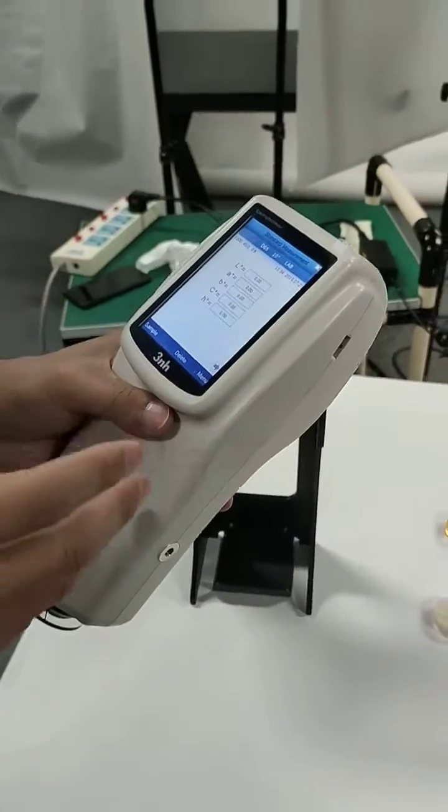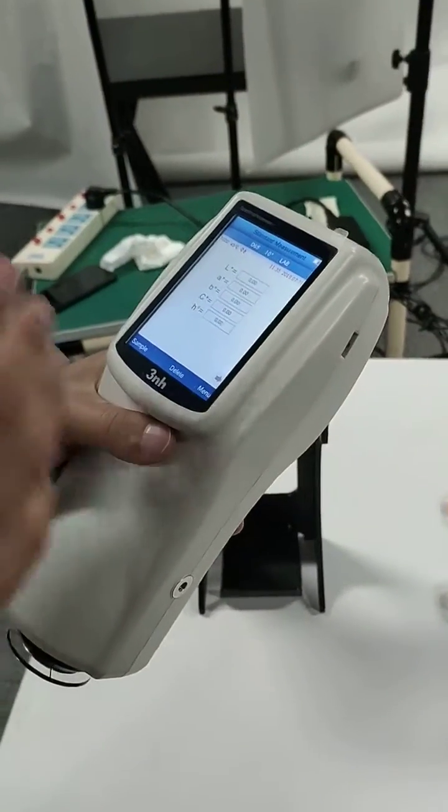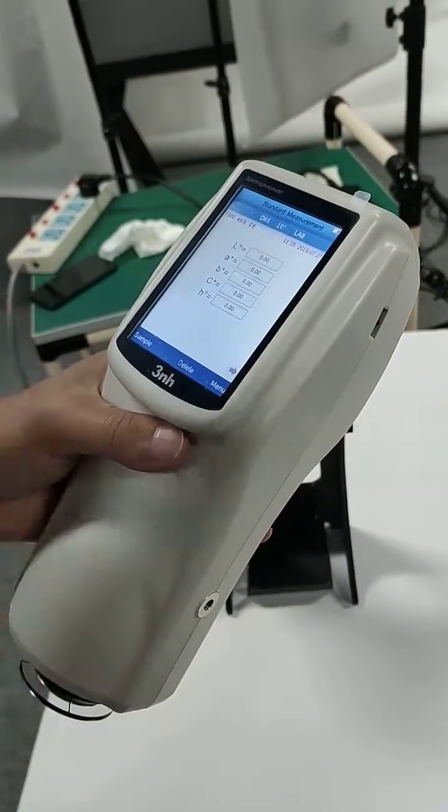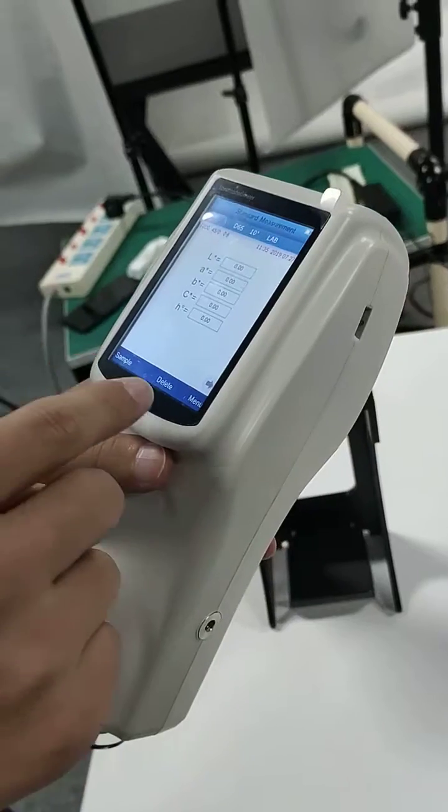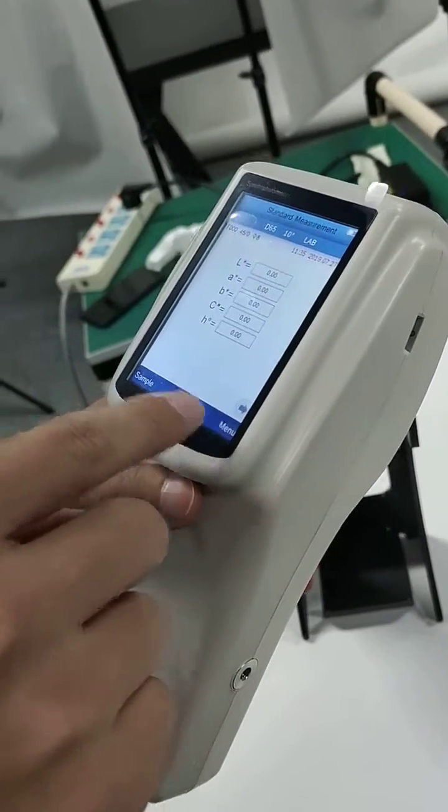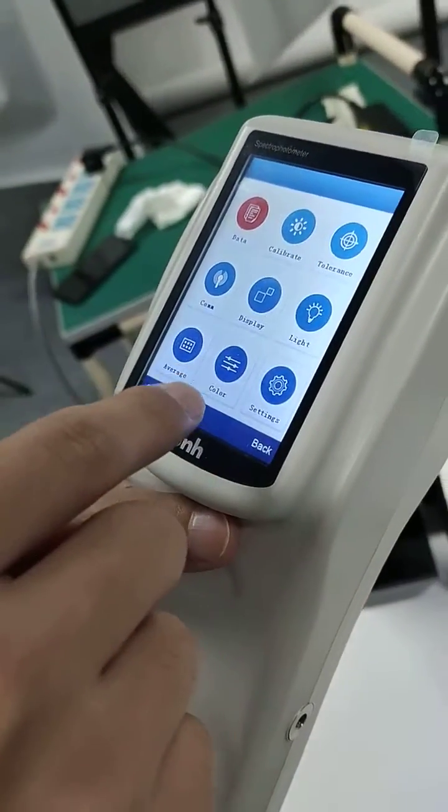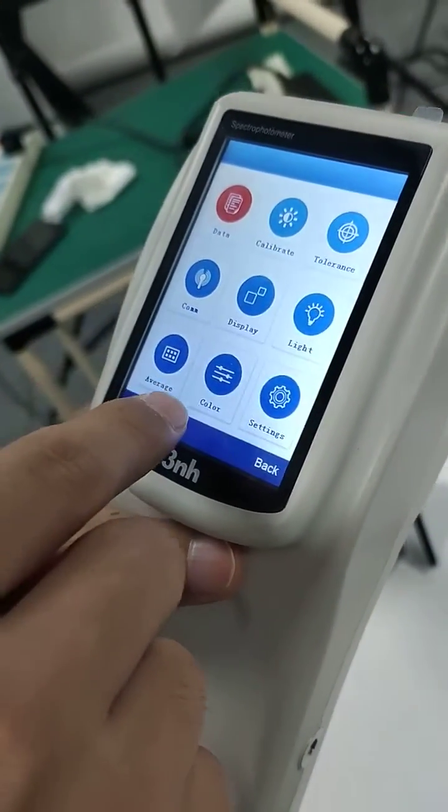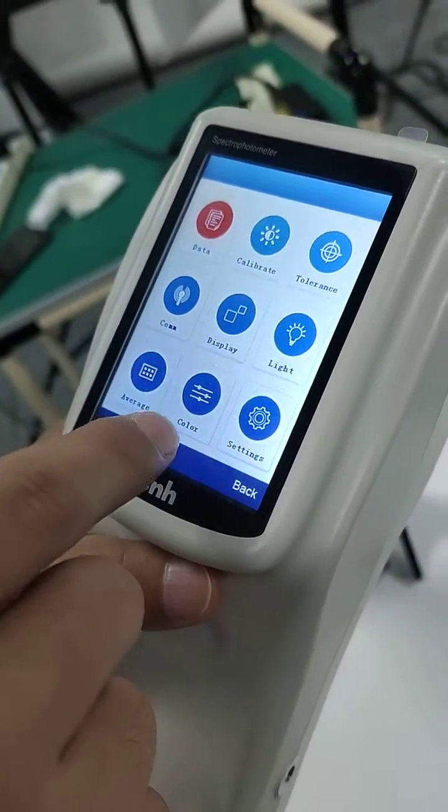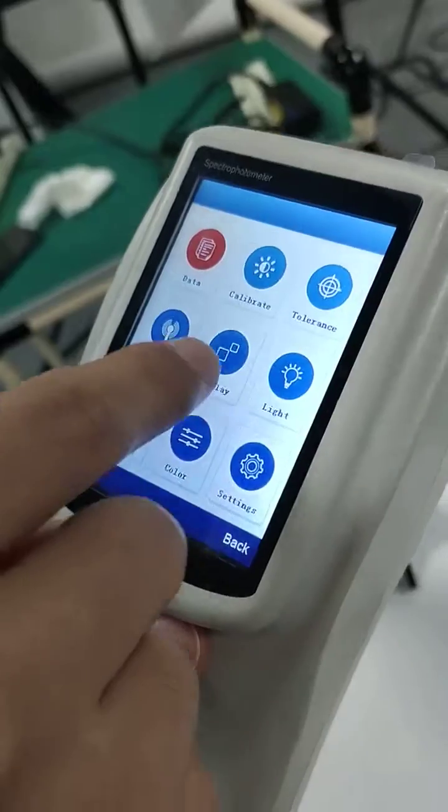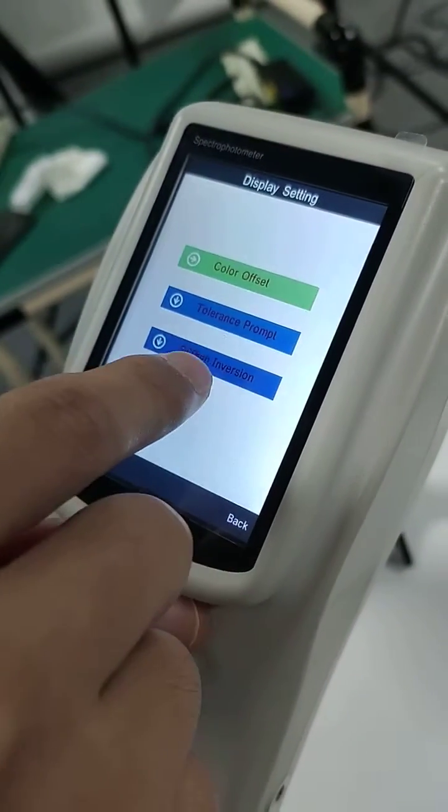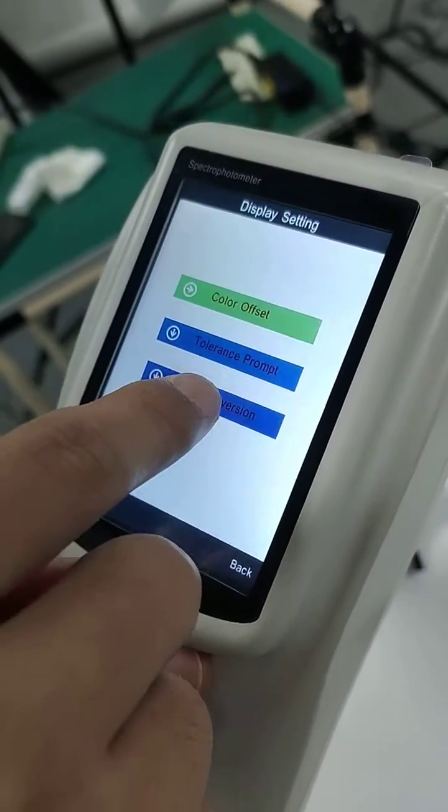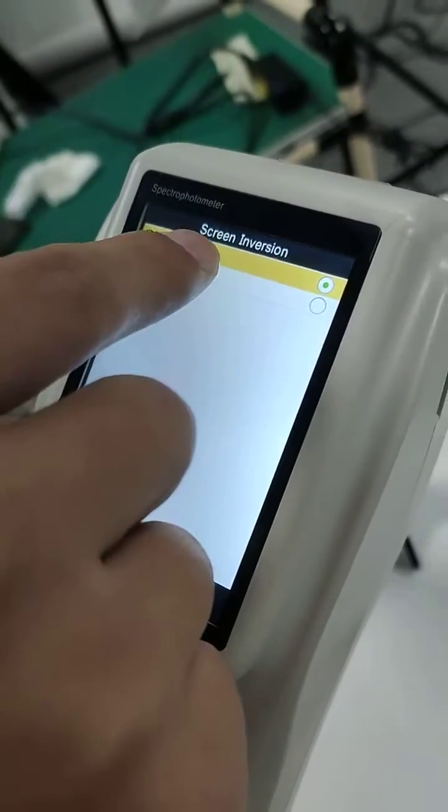After we calibrate the instrument, we need to do a setting to reverse the screen. Here, screen inversion. On.